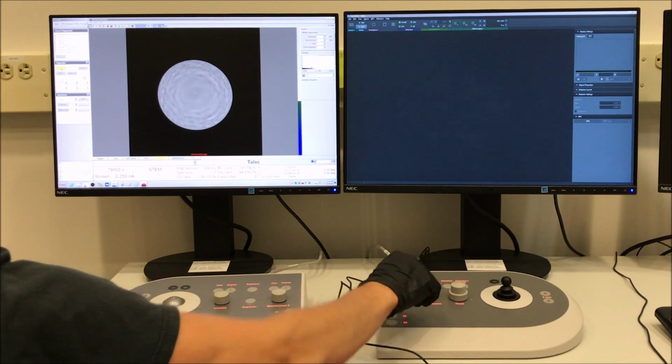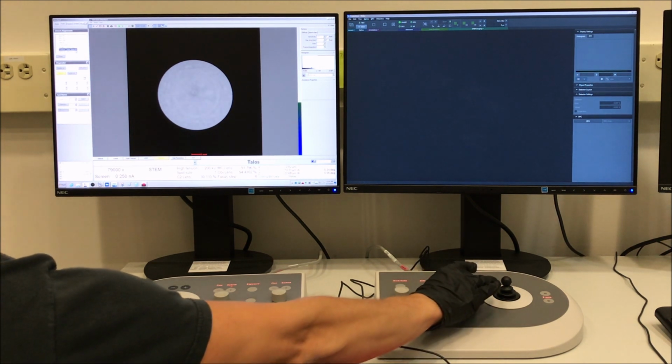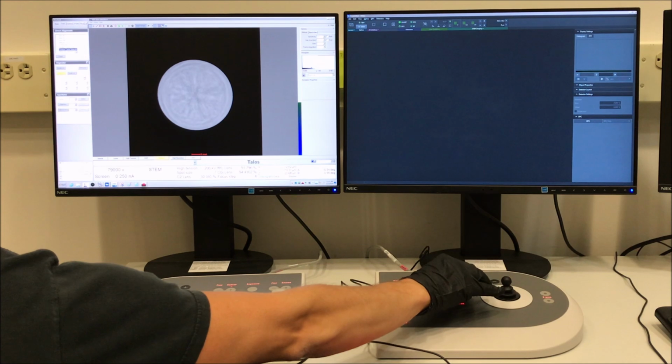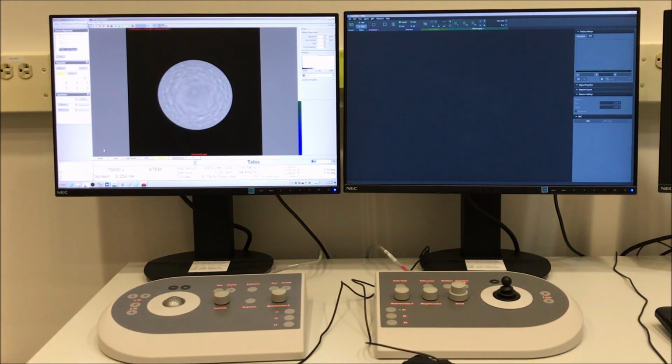So I'm going to set my focus step to 4, go to Direct Alignments Control Panel and select Rotation Center Intensity, then use my large outer focus knob, turn it all the way counterclockwise until the pulsing stops. Then I can pulse it manually. I'll make a quick adjustment to the FluCam here to make this a little easier to see. Again, I might have to manually adjust my exposure time.